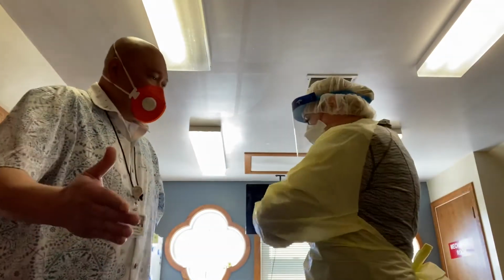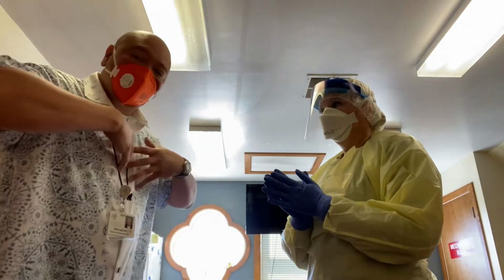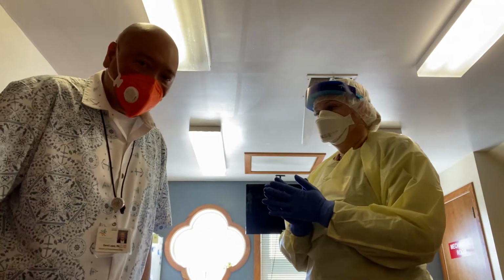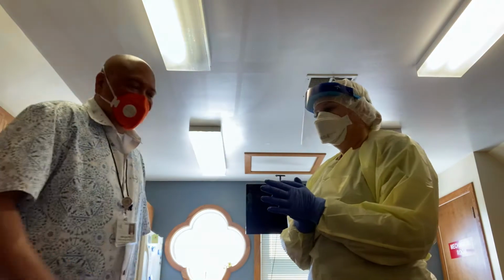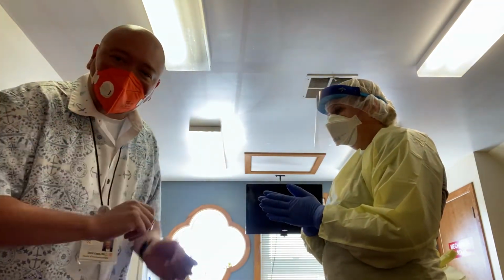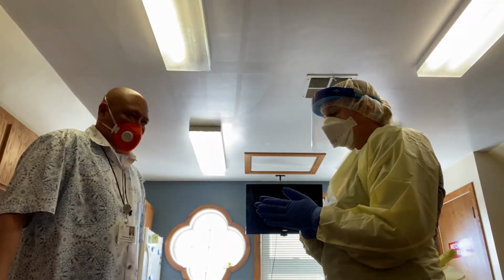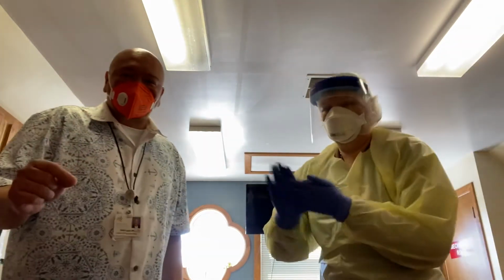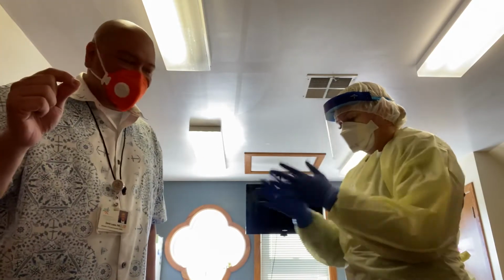Now, when she's done and she needs to doff or take off the PPEs, there's a certain process for that. So the next step will be doffing of the PPEs. The first step is to remove the second glove, the outer glove, first and dispose of it. Sanitizer first. Sanitize and dispose. Every time she touches anything, you sanitize. So she's sanitizing the outer glove.